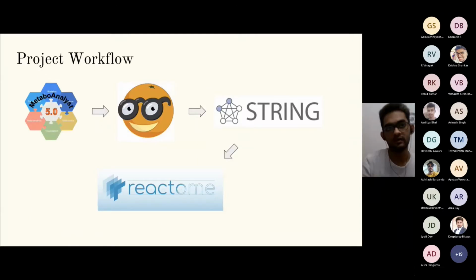This is the project flow. Basically, I started with MetaboAnalyst. I did some analysis using MetaboAnalyst and normalized the data. That data is used in Orange after some processing, and the major proteins that we get as a result of MetaboAnalyst and Orange are given as input for STRING and Reactome for further analysis.